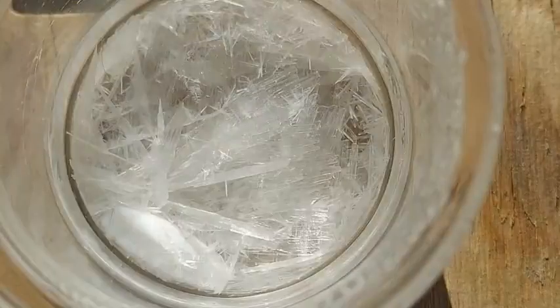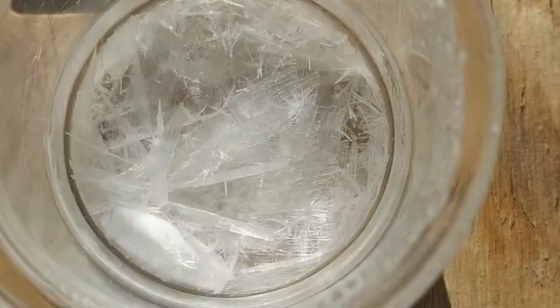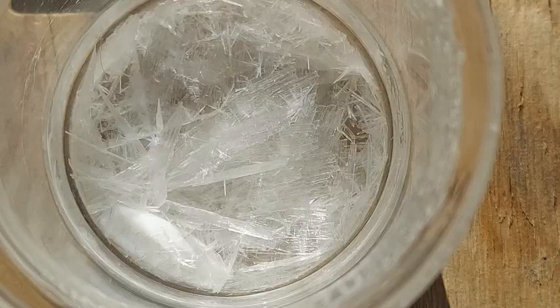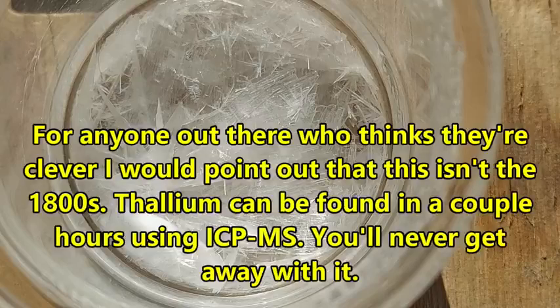I've evaporated it down to a little under 40 mL and we have some absolutely beautiful crystals — I do love pretty death crystals. That's like enough crystallized thallium sulfate to kill 15 grown men. Never feel so alive as when you're holding a beaker full of death with beaker tongs.